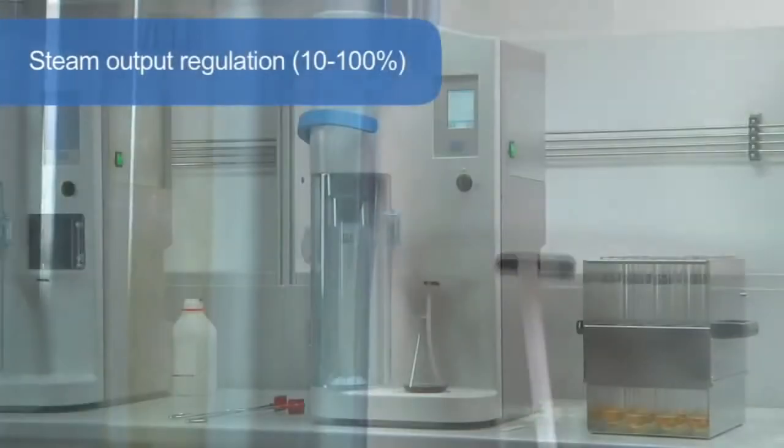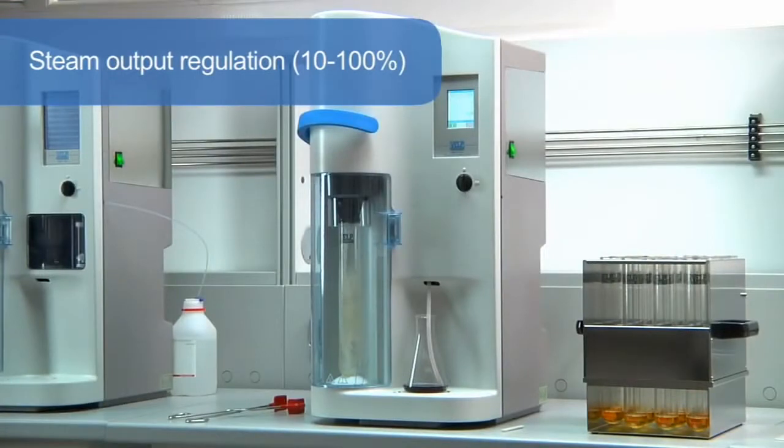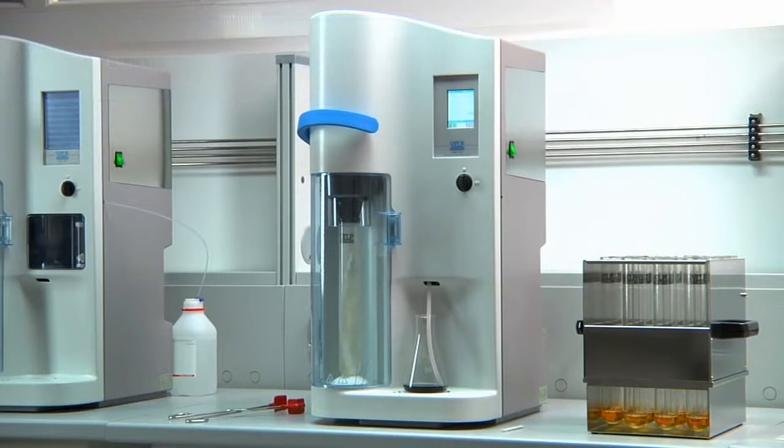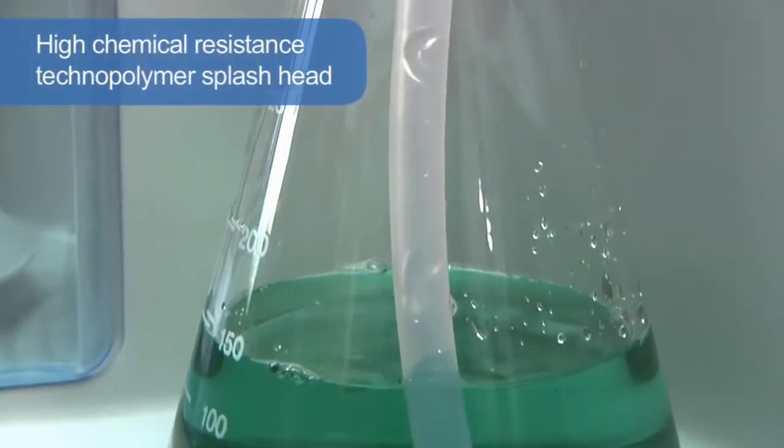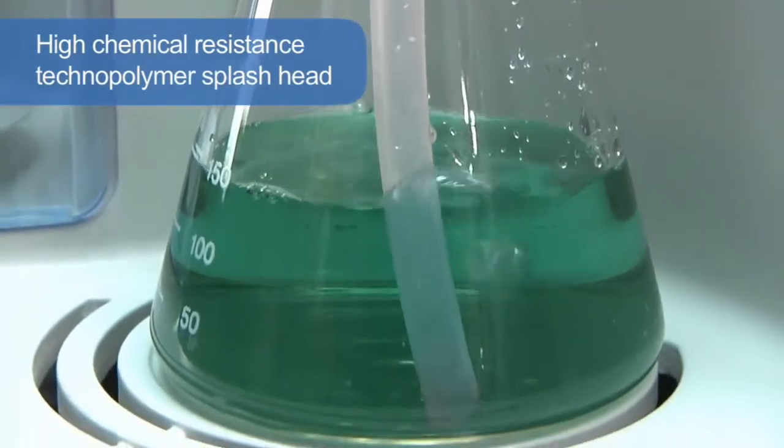Thanks to the steam output regulation, 10 to 100%, the UDK 149 is recommended for many applications, including alcohol, volatile acids, phenols, sulfites and TVBN determination. The high-chemical resistance technopolymer splash head is the most resistant solution available.